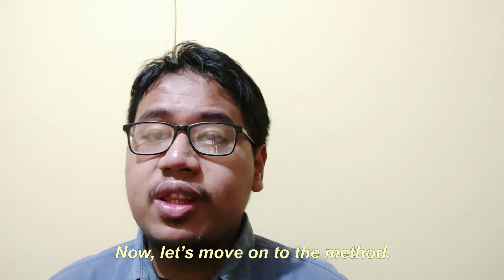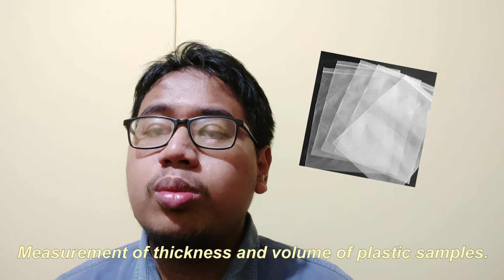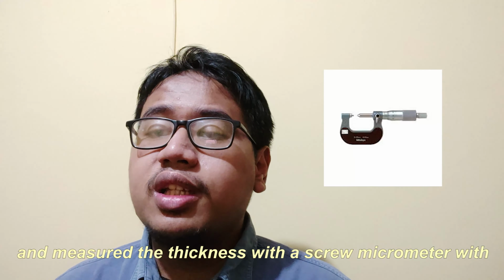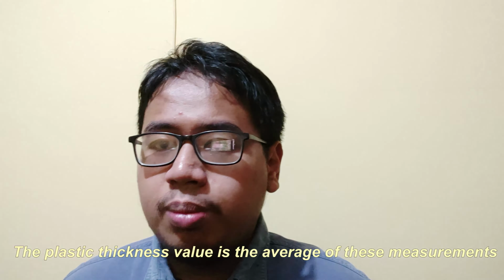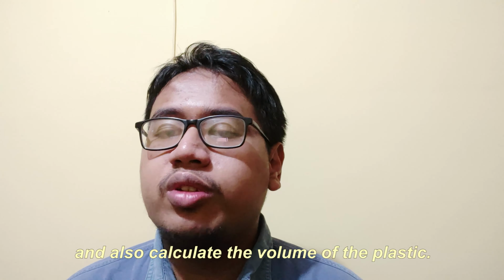Now, let's move on to the method. There must be a preparation before we get into the migration test, for example the measurement of thickness and volume of plastic sample. The plastic was cut into 10 cm size using a caliper, and the thickness was measured with a screw micrometer with a resolution of 0.005 mm at 5 different locations. The plastic thickness value is the average of these measurements, and we also calculate the volume of the plastic.